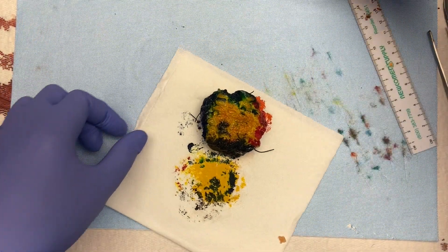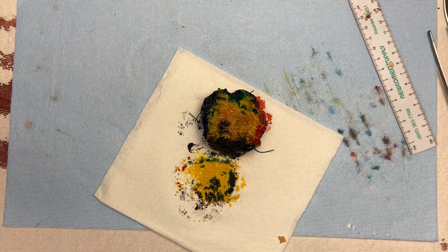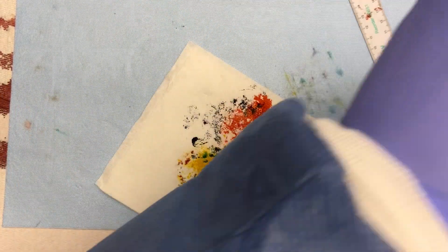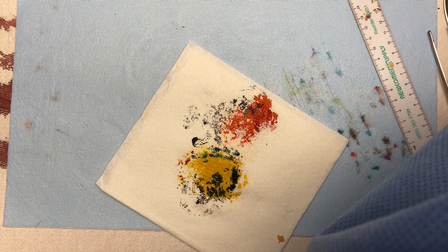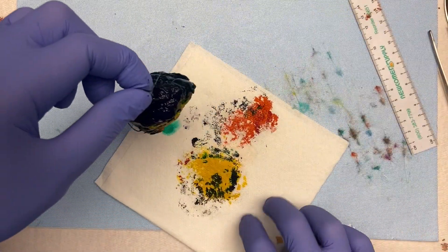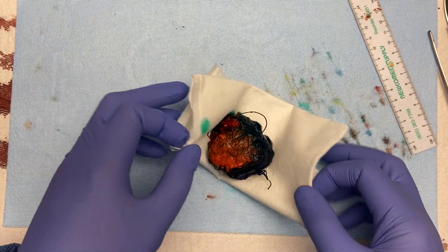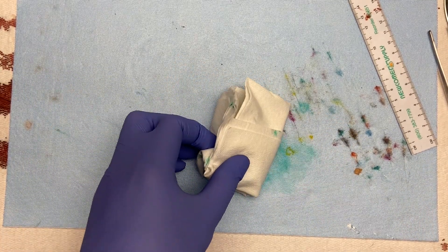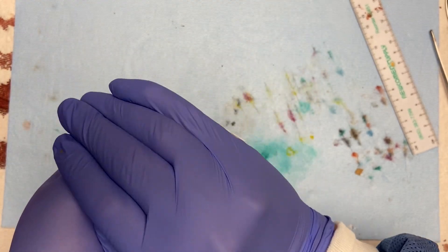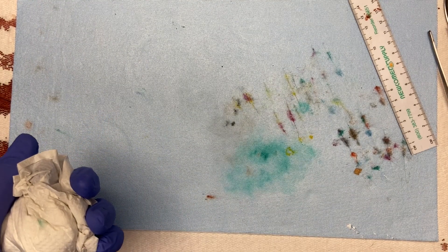With the specimen completely inked, rinse it in vinegar or dye-fixing solution, whichever you have, and then blot it dry. This will help the ink from running as we cut and give our margins a little more stick.